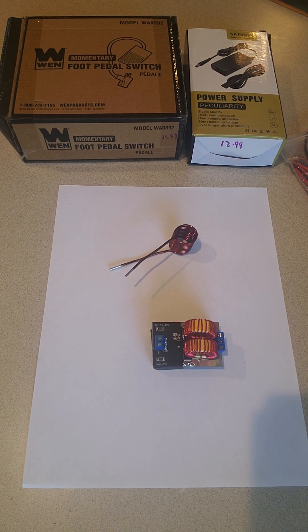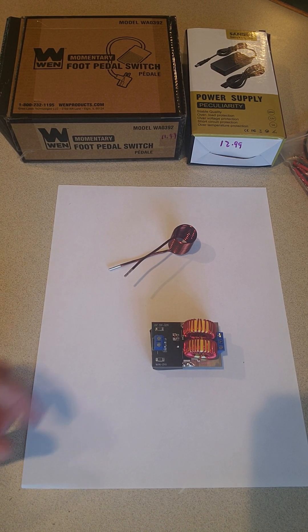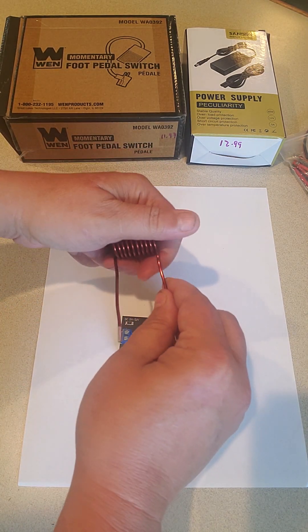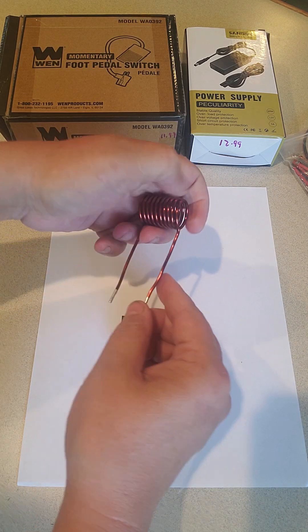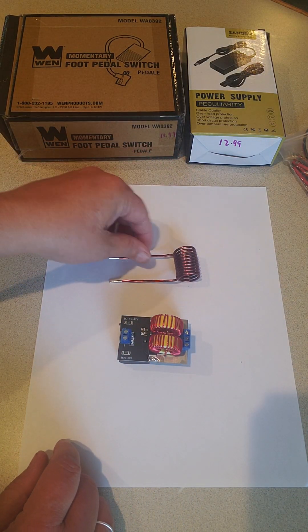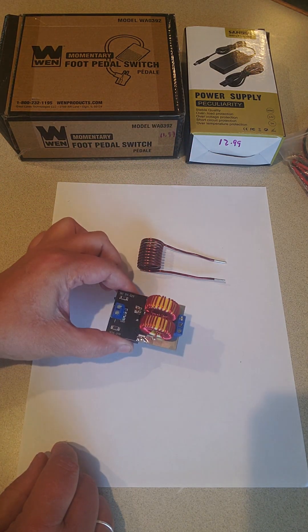Real quick today I'm going to show you how to make an induction scalpel sterilizer. The first thing you're going to need is an induction heating board. You can buy them from Amazon, I've seen them on Walmart.com from other sellers. The big issue is you want to make sure that it comes with this coil, because some of them do not — and that's going to be really important.